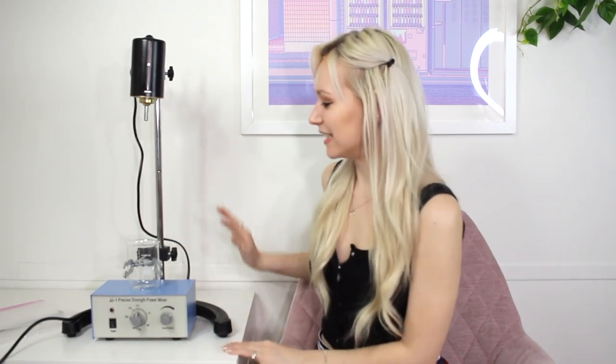Do you need the overhead mixer? No, not at all — you can just use a good old immersion blender. Is this more convenient? Heck yeah it is. Is this the best quality? No. Do I recommend buying it? Totally — if you've got 60 bucks, totally buy this. I'll link it down below if I can find another listing on eBay, and I'll also link to some of the more expensive ones on Amazon. Those will be affiliate links, which means if you decide to purchase I get a little percentage of the sale — it doesn't cost more for you, it just helps me out. Anytime you see links in my description going to Amazon or makeyourown.buzz, they are affiliate links.